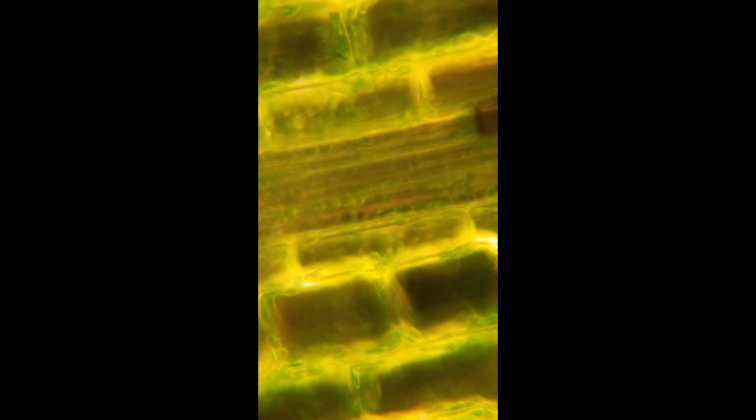Now my phone's focus is being a little bit jittery. Look at that.